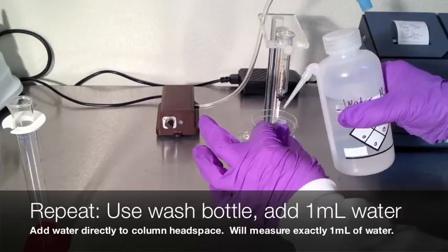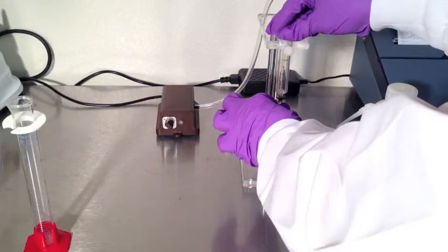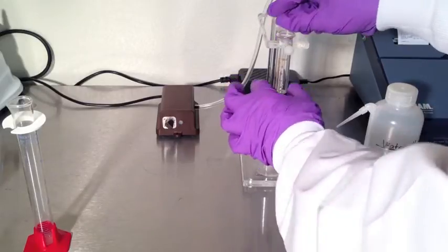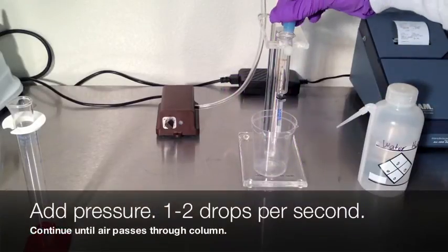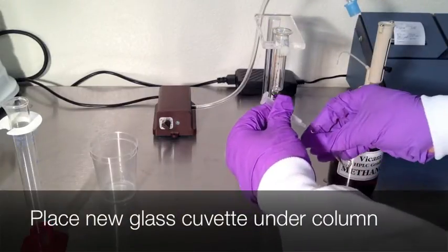Now repeat the last step. Add one milliliter of water directly to the column head. Apply pressure and pass one to two drops per second through the column until air passes through. Remove the column from the pump stand.